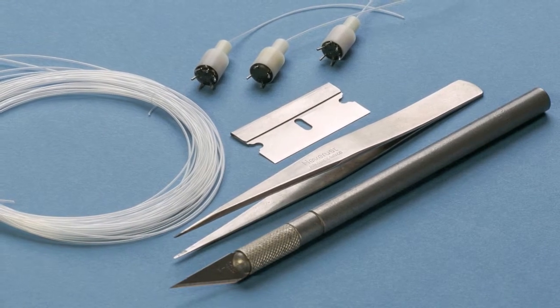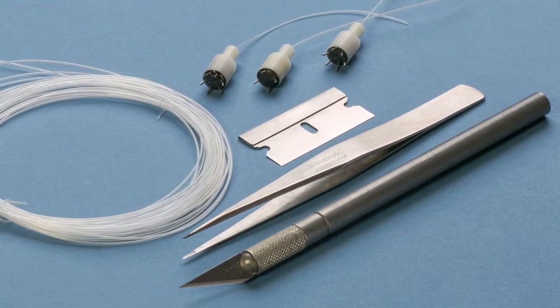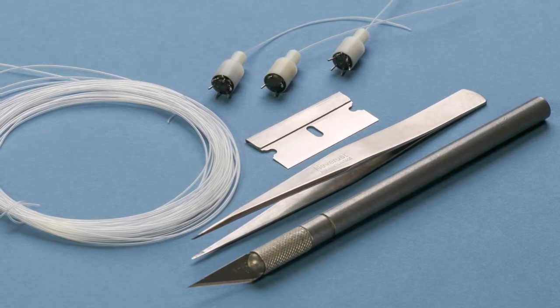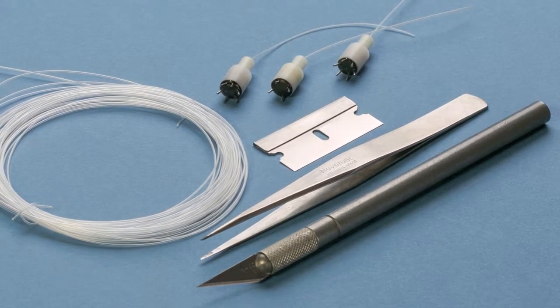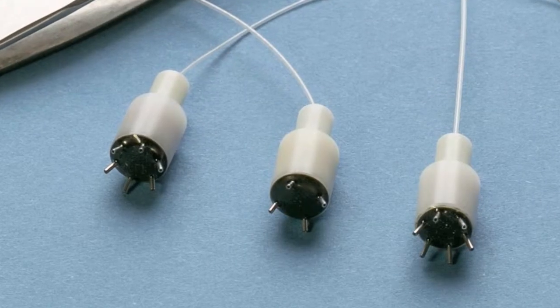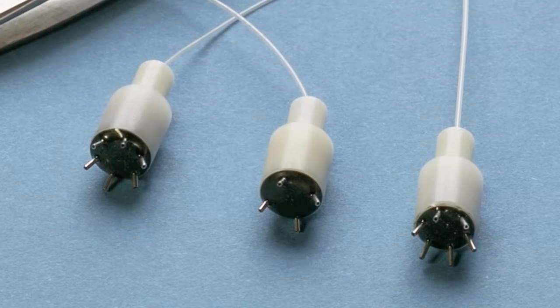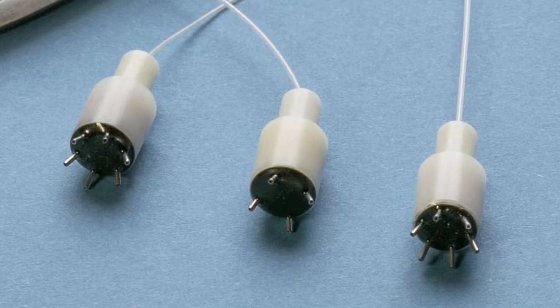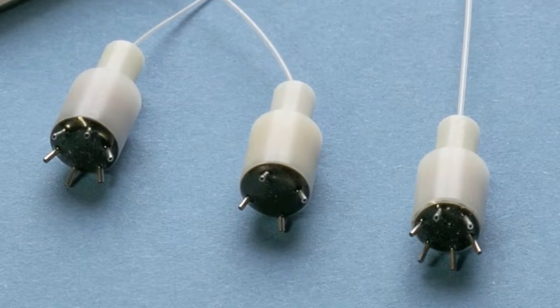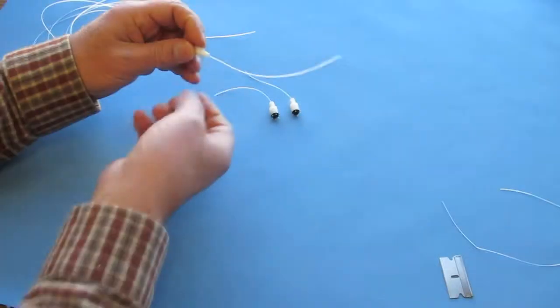The tools required for this job are a single edge razor blade or a scalpel and a length of PE10 tubing. You'll need about 8 to 10 inches of tubing for every manifold. Forceps are optional and may help you hold on to the tubing while you're stretching it.